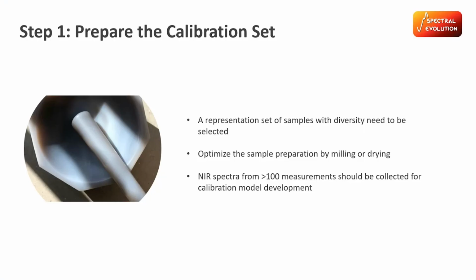So it's important to constantly be checking your model to see its performance with some lab data. But it's also important to note that you won't have to be using as much lab data as if you were just using lab data to do the soil analysis.